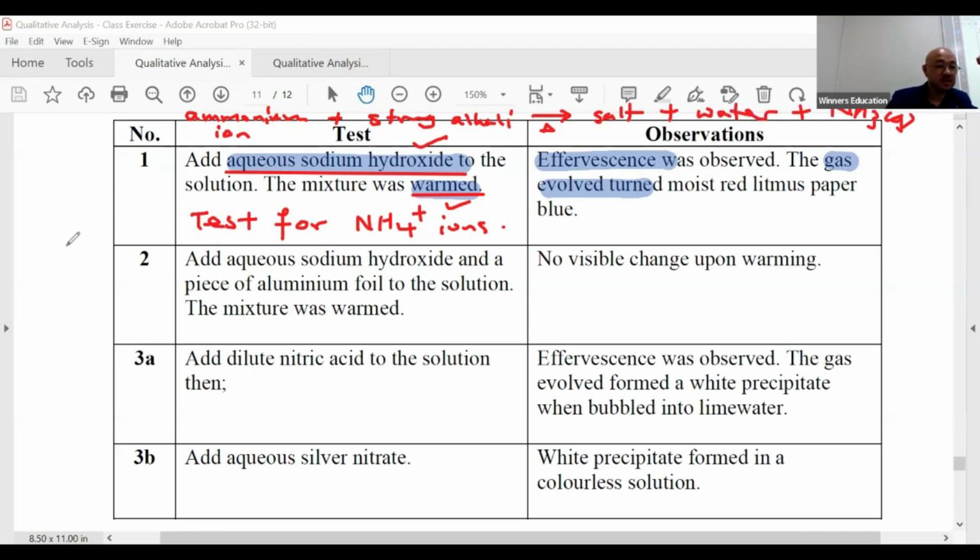gas. So ladies and gentlemen, before I even touch anything, as I read the test procedure, I have my red litmus paper ready. I got my distilled water squeezy bottle ready. And I am going to test it. I'm not going to test for oxygen gas with the wooden splint. I'm not going to test hydrogen gas with the wooden splint. I won't test for any nonsense. I'm testing for ammonia. Are we talking, my friend? Done. So you read your procedure and you get ready. Make sense to you? Okay? That's it. Done. All right.